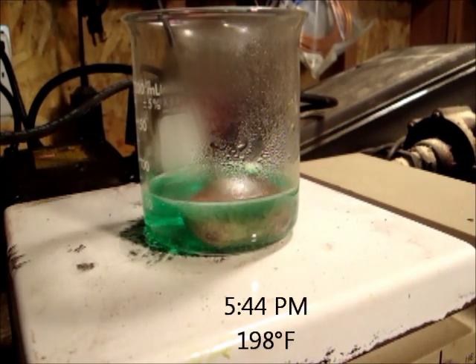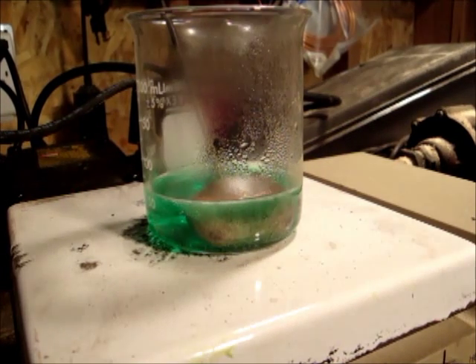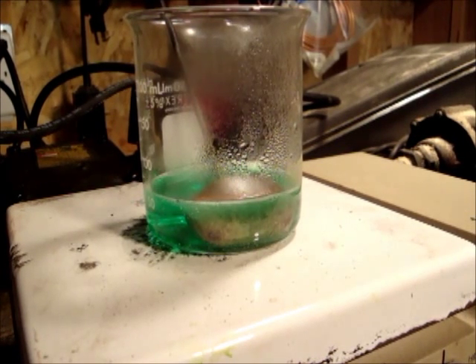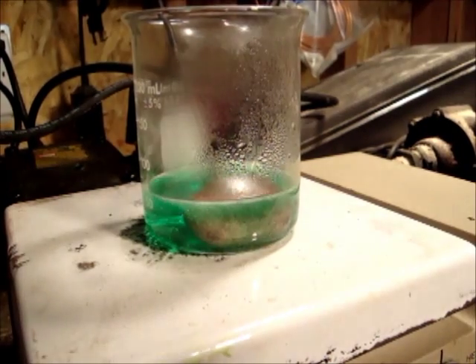Temperature behind the beaker is 198. I'd bring this camera in a little bit closer to see if you can see those bubbles a little bit better. Bubbling pretty good now. A little steam coming off the top. So looks like we're cooking now.